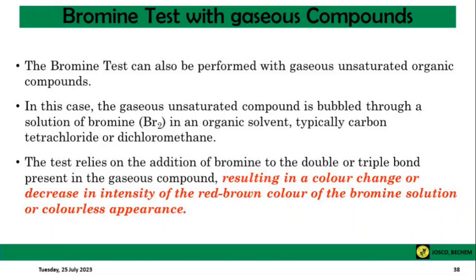In this instance, because we are dealing with the gaseous unsaturated compound or the gaseous sample, that sample would be bubbled through a solution of bromine. In other words, the gas would be passed through the bromine liquid. This is done in an organic solvent.